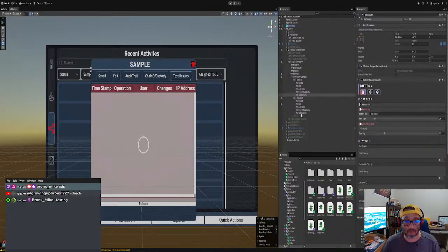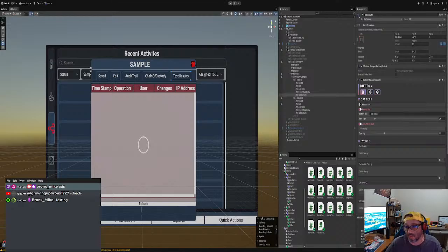We still got 4. Okay, this does not contain a sample type. I'm gonna say sample type name. Is it name? I think. Yeah, it's name.